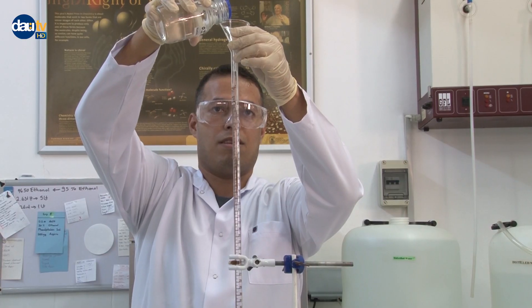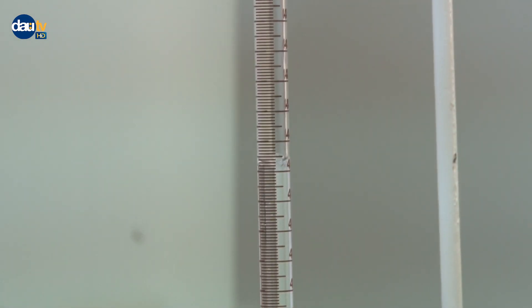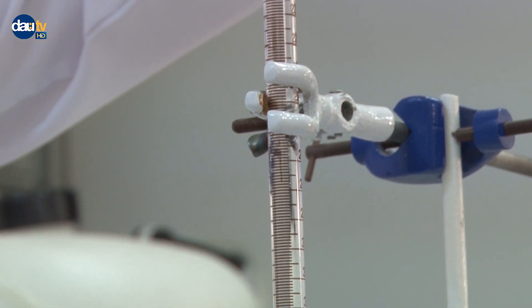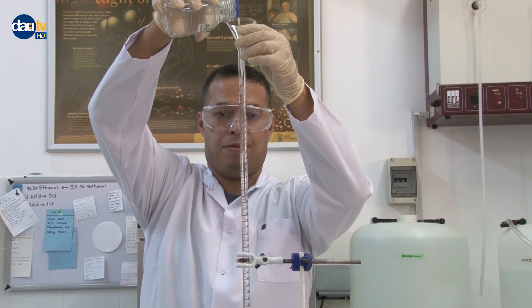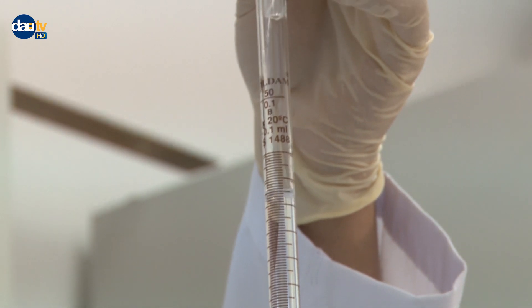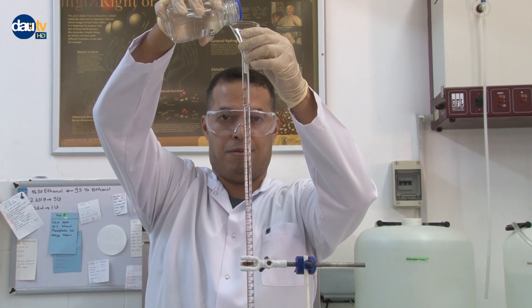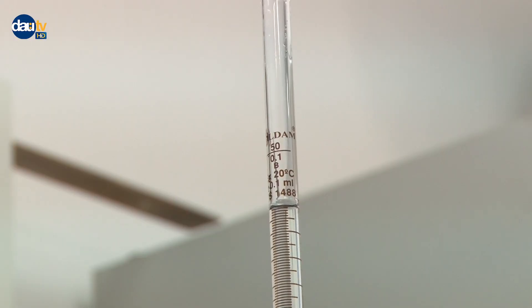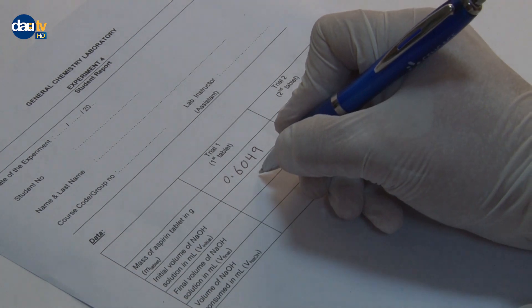Fill the burette with 0.200 molar sodium hydroxide solution and record the initial volume.